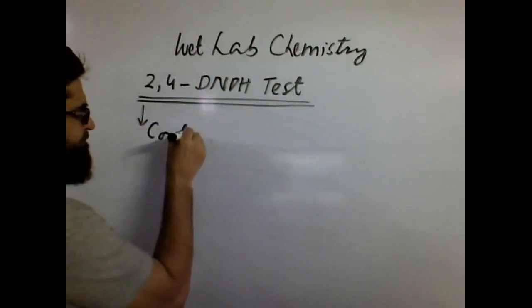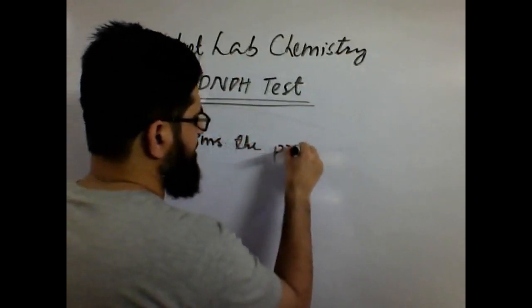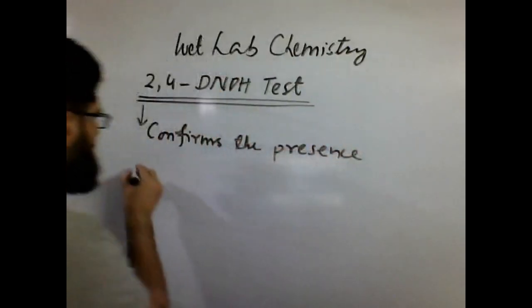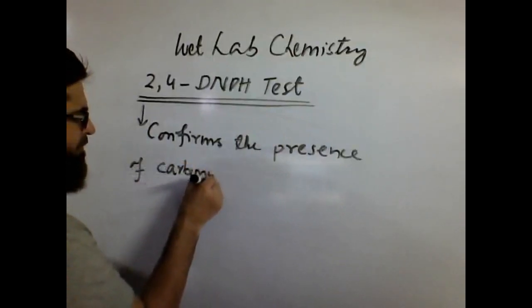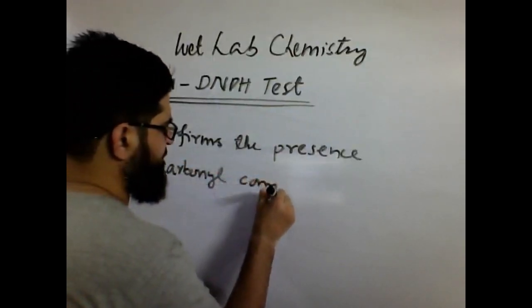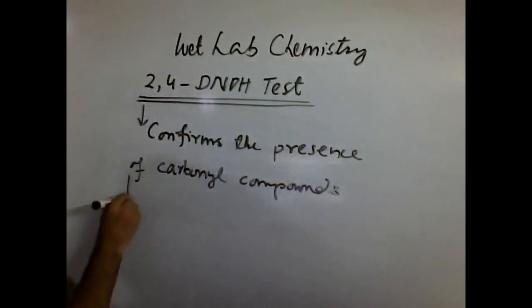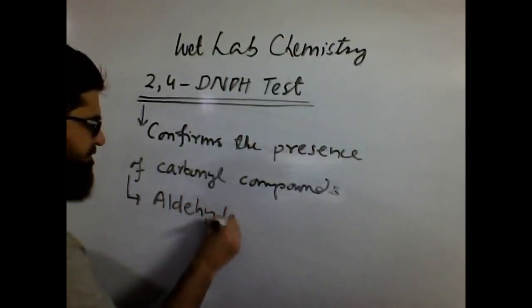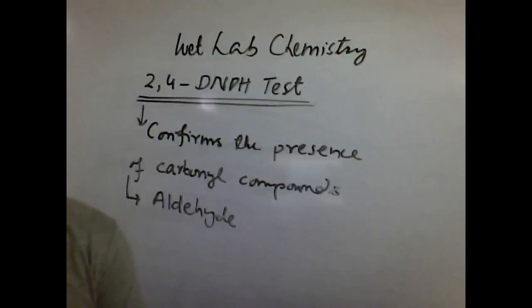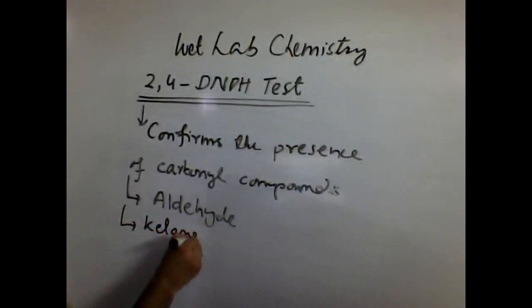That is the test that actually confirms the presence of carbonyl compounds, and those carbonyl compounds could be an aldehyde or a ketone.